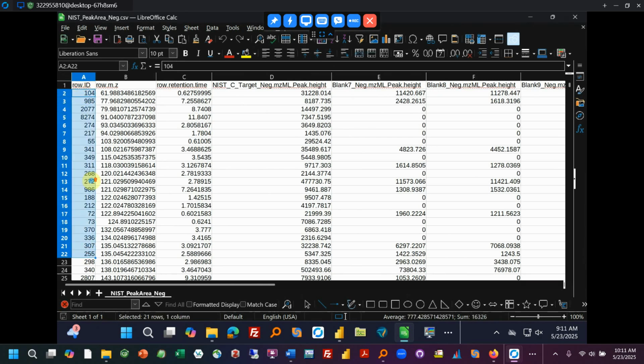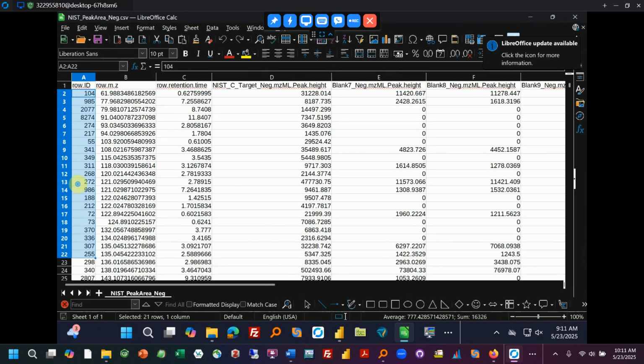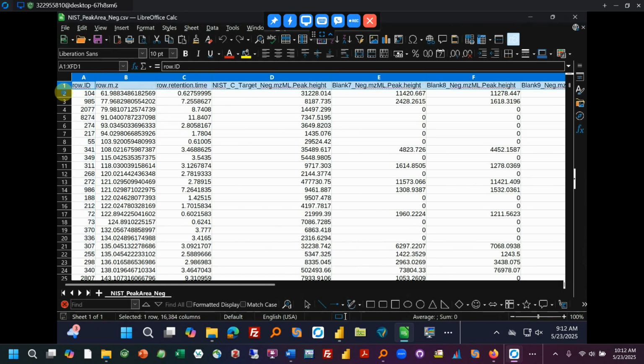So let's say Compound Discoverer doesn't report identifiers in your table. You can just put 1, 2, 3, 4, 5, 6, 7, 8, 9, 10 down your sheet and drag down. No problem. So you can just make up identifiers. The other thing is, while in previous versions we may have supported different numbers of headers, in this case we only support a single header. Maybe in the future you can look in the comment sections or note if we have allowed you to have multiple headers. But in this case, just a single header.